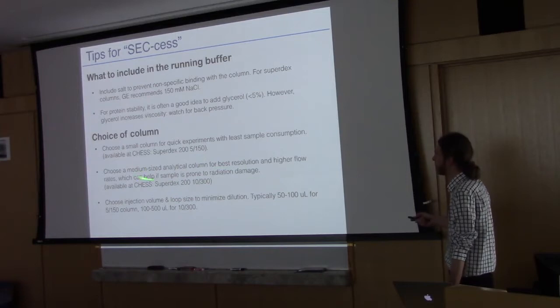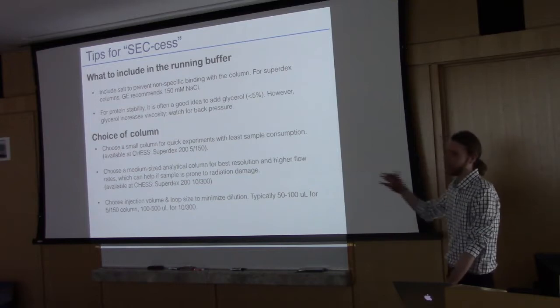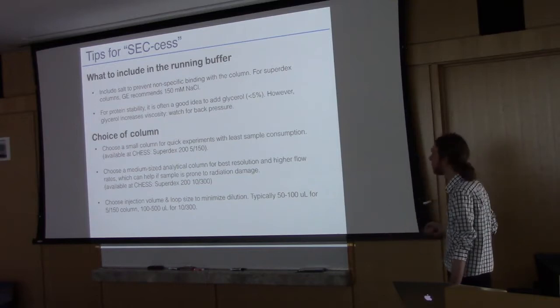So this can be good if your sample is prone to radiation damage. You're going to use more sample, but you're flowing it through the beam or refreshing it more quickly. So that's cool. And this one would give better resolution.